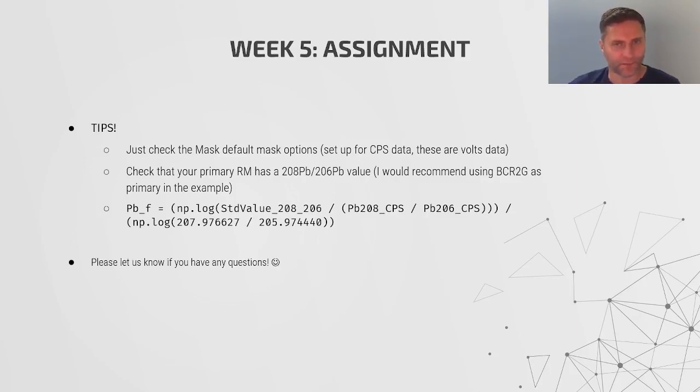Of course, there are some things in there that are quite tricky, and there's a lot of concepts to cover, but please let us know if you have any questions. We're always happy to help. We hope that these assignments will really help consolidate your knowledge in the material that we're presenting, and that they'll allow you to go off and do amazing work of your own.